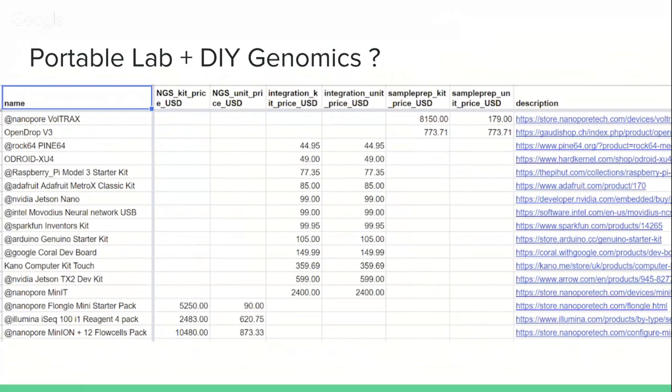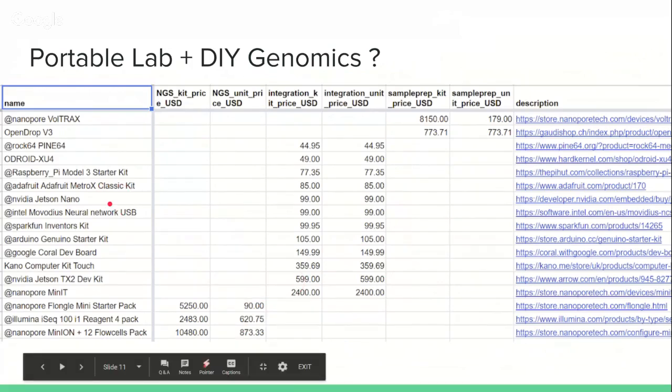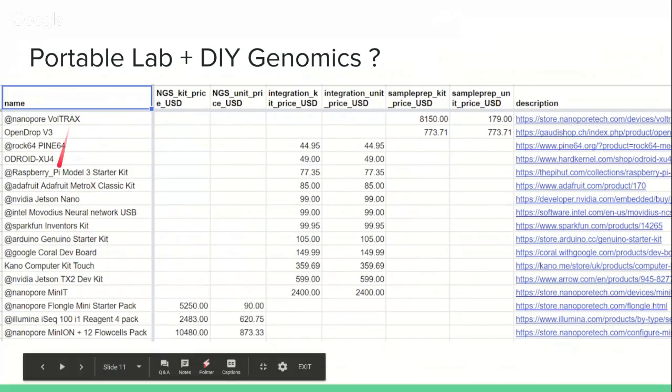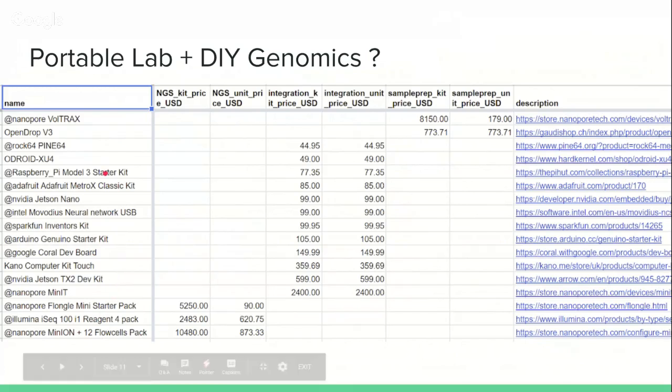In the case of many scientific projects, here is what can we do today? Where is the limit? What's the bottom? The minimum that you can do to do some genomics yourself, do some of your own genomics at home. And this table that you can find at bit.ly/DIYomics, the DIYomics page that I maintain, I put together different elements that I think people are probably going to muse about when they think about doing their own genomics.